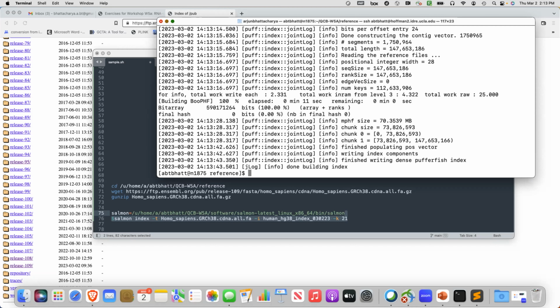Also, when it's computing, because it has to compute ties between different sequences, it always has to be an odd number, and it can be as low as 11, I think. So most of the time, this is not going to make too much of a difference in quantification, especially if you have sufficiently long read lengths for your FASTQ file.